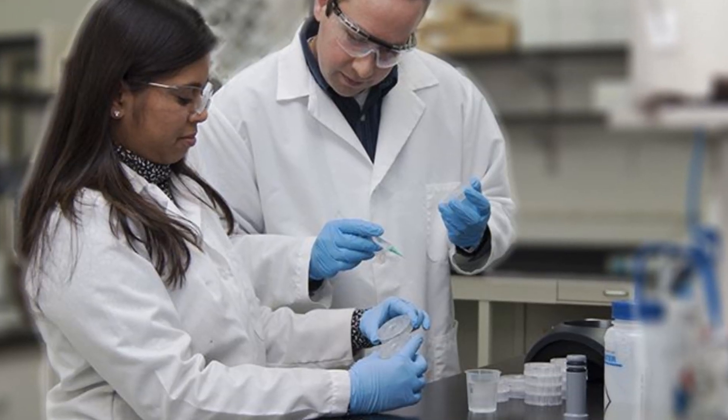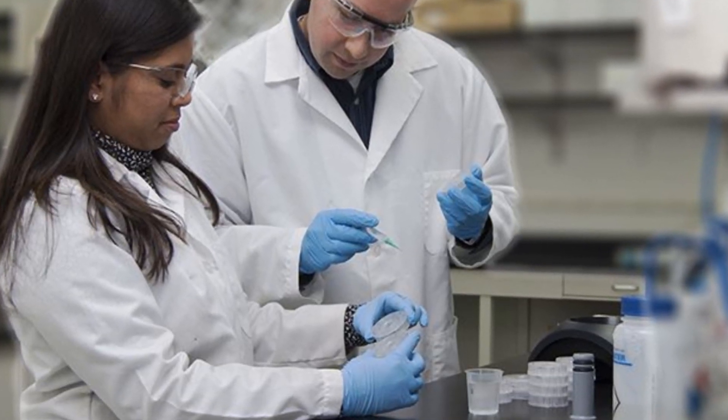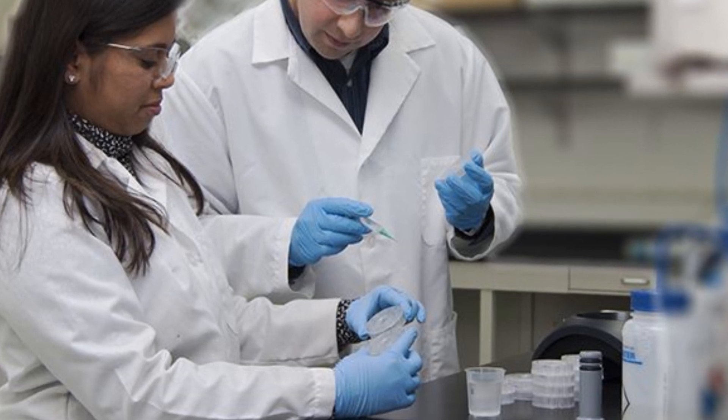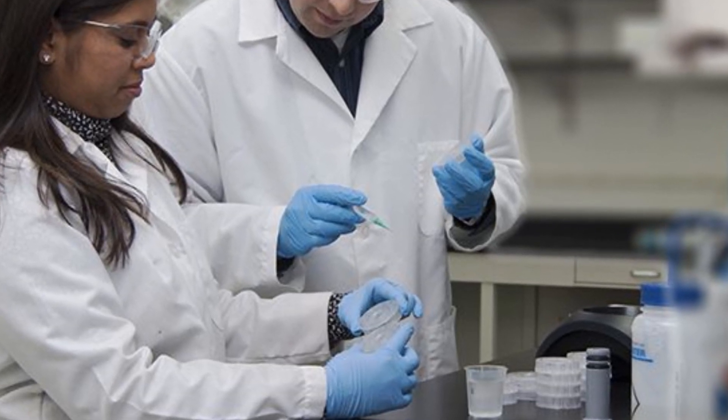With a team of chemists and engineers from across the country, Lamont spent seven years developing a way to test water precisely and faster than ever.